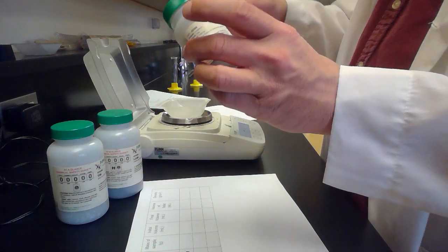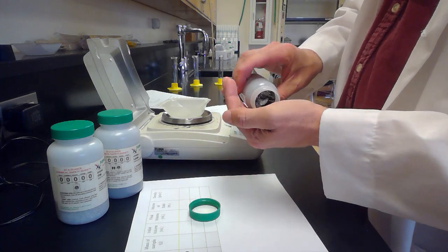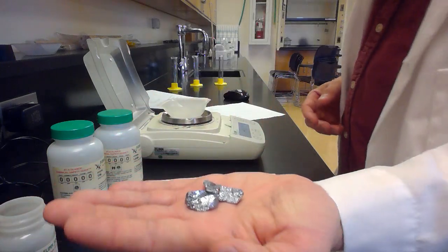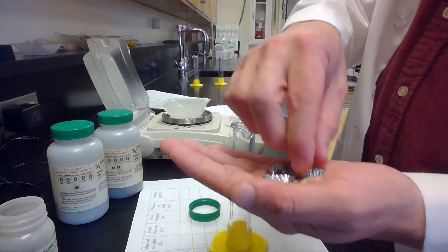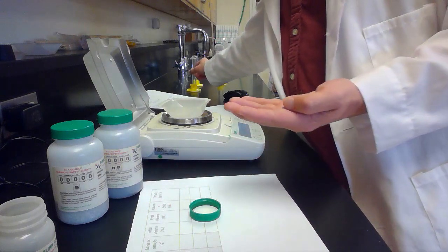So I'm going to open my bottle of silicon here, and I'm going to pour some out here. Now, having done this lab before, I know that sometimes these little bits of silicon might be bigger than the top of this, so I'm just going to check and make sure they're not. And these ones are good.